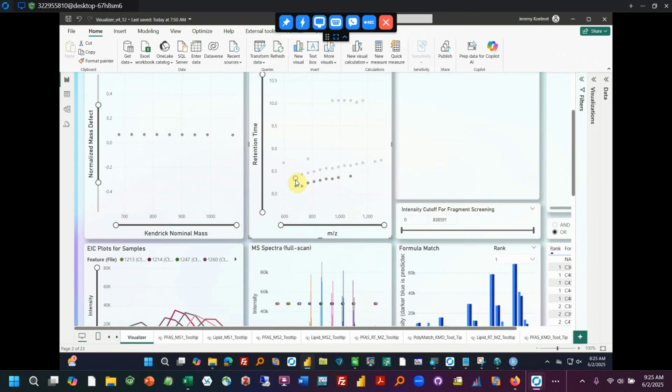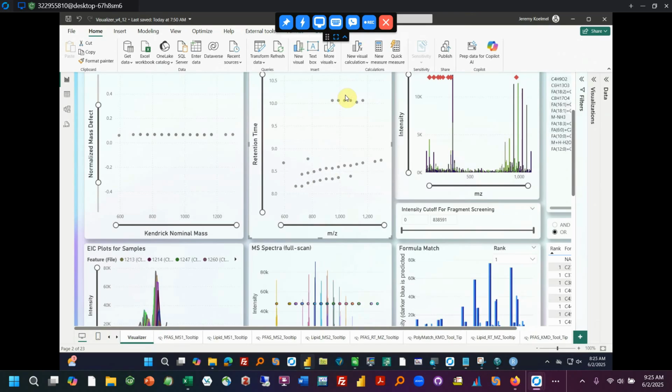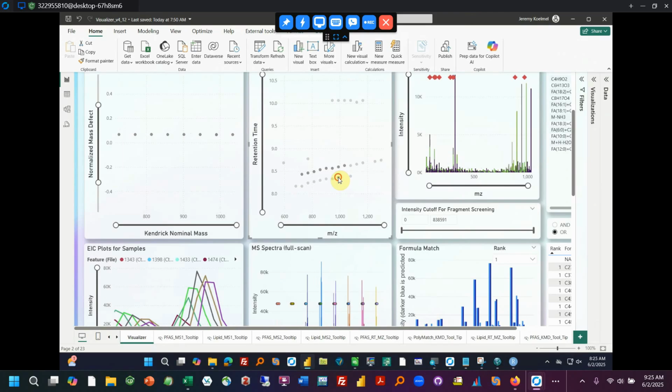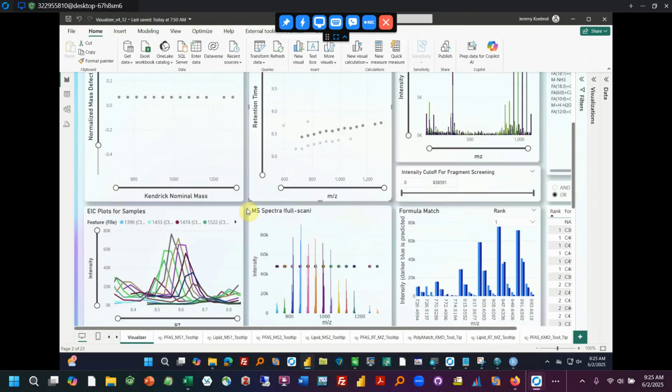So it looks like the only series, these are polymer series, clearly, or at least these two. This one, the retention time behaves a little strange because it doesn't move with retention time. So this is going to be our series that is correctly annotated, at least. Doesn't mean the other ones are not series, they're just potentially not the right annotation.